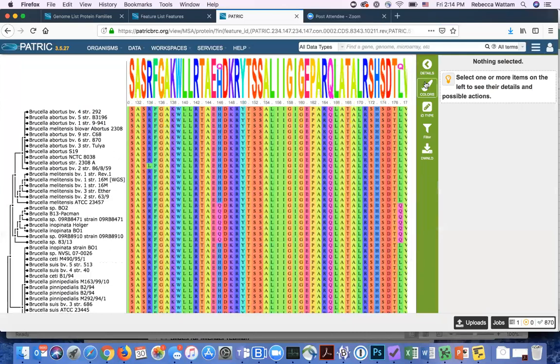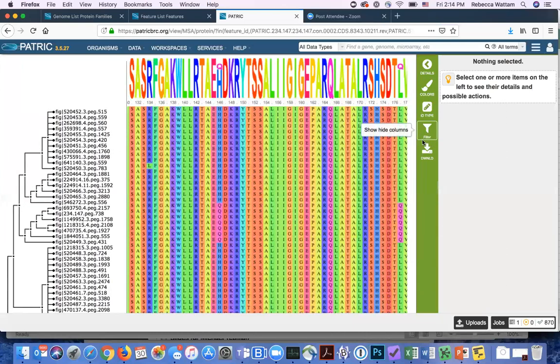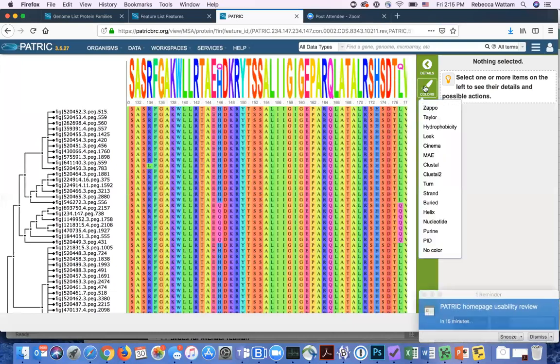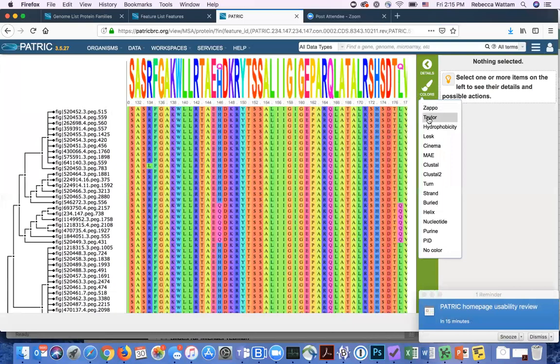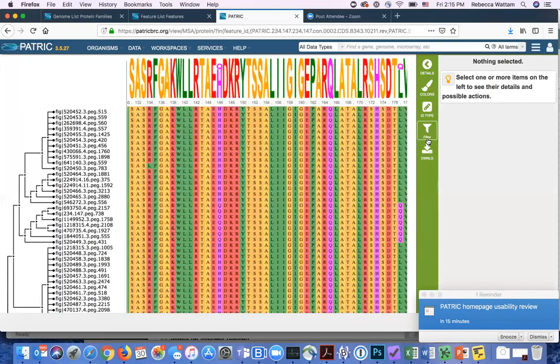You can go in, you can change if I want to see the gene IDs as opposed to the genome names. You can click on that and then in PATRIC, this will be the identifier that tells you what the genome is and this number after peg is the gene number. You can also go in, and this is pretty cool, you can give it different colors and recolorize the alignment.